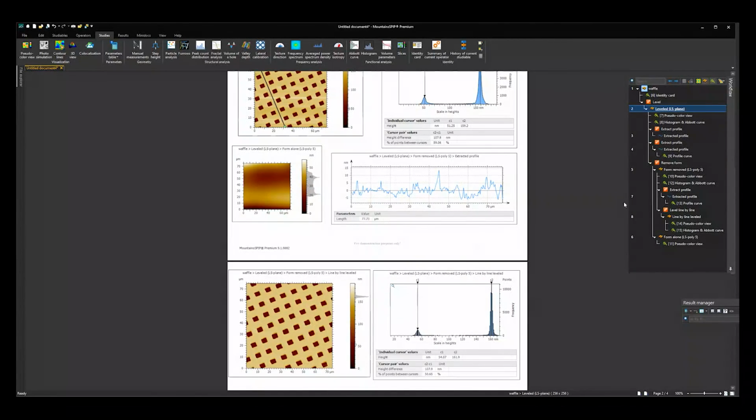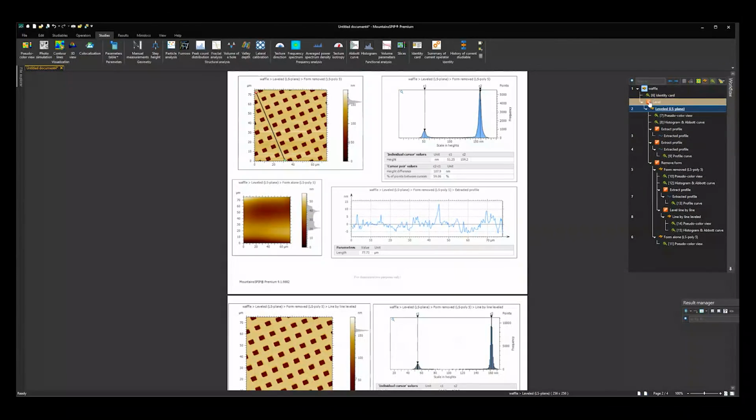You can save it. You don't need to screenshot it. And then if I have a lot of images that need the same kind of workflow, I can just right click here, substitute, and put in a different studiable. So that's kind of unique to MountainSPIP, but also something that I particularly enjoy in terms of this workflow for teaching and showing other people.